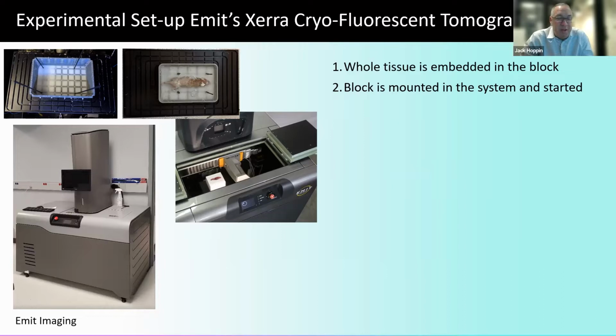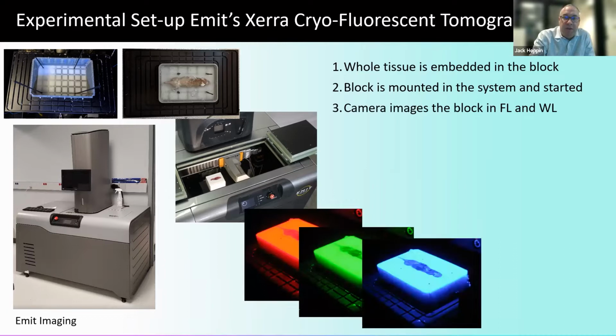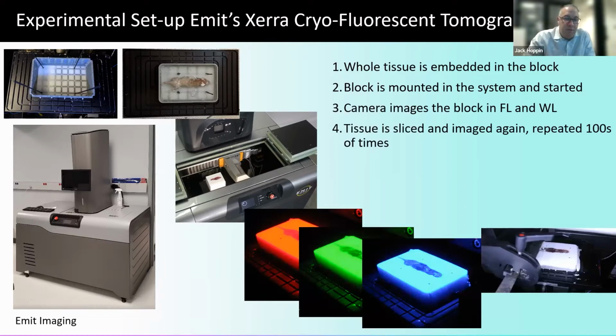The resolution is still mind-blowing to me, in terms of sectioning at 10 microns, and then you think about a microtome going to a micron. This is high precision performance. And in this case, you don't need to decalcify. A cryomacrotome does full frozen rodents. You image in the RGB, and then you can image at any wavelength you want. Depending on how you've configured your study and what fluorophores you're trying to image, you'll have multiple images that you can reconstruct and co-register at the end of the study.